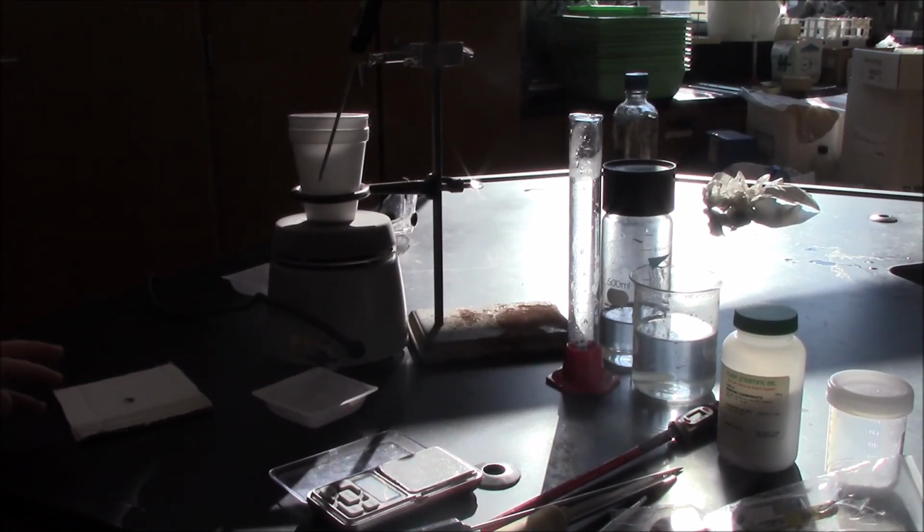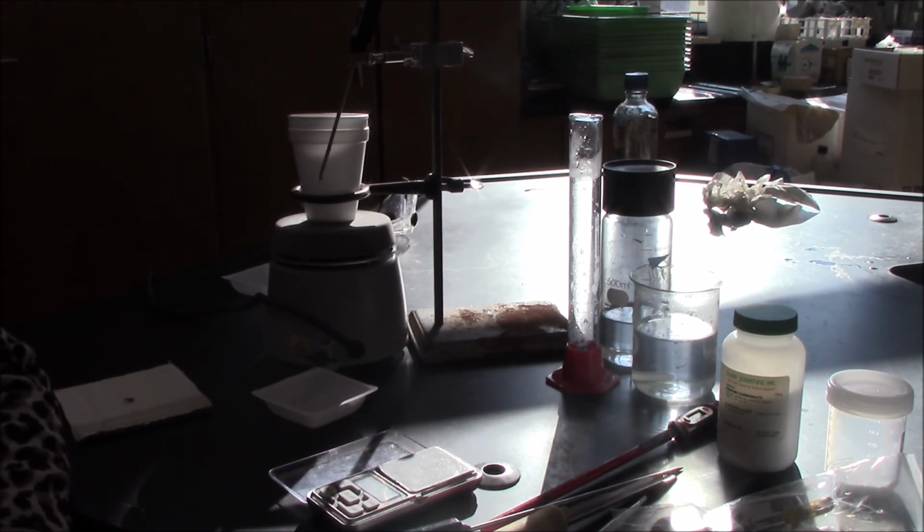For the inquiry portion of this lab, we are going to be measuring data for temperature change as a solid is dissolved in 50 milliliters of water. We're changing the volume to 50 milliliters of water here simply because that is the criteria we're requested to meet as far as designing a hand warmer.